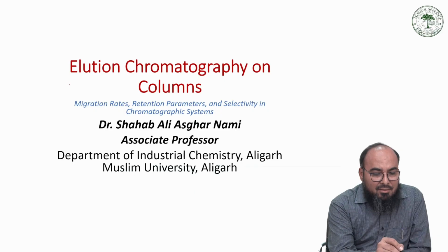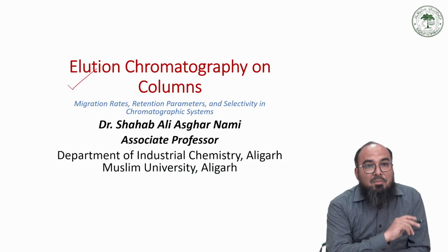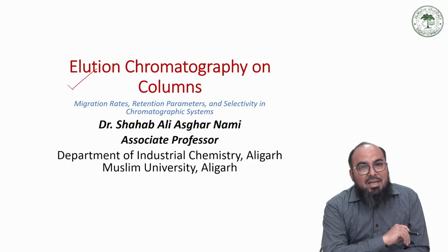Elution chromatography may be defined as the basic, or you can say the simplest, chromatography among all the various chromatographies which we have described in our previous slides.